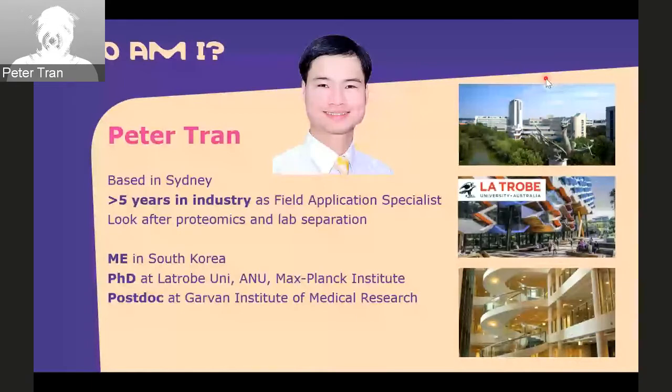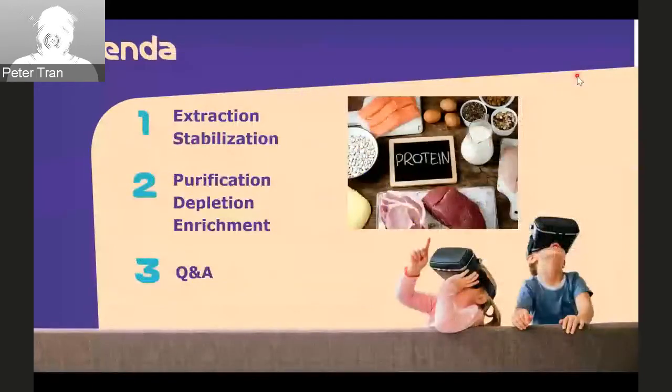Today I'm going to walk you through extraction, stabilization, purification, and depletion, and of course they all relate to protein. And the last session is the Q&A.